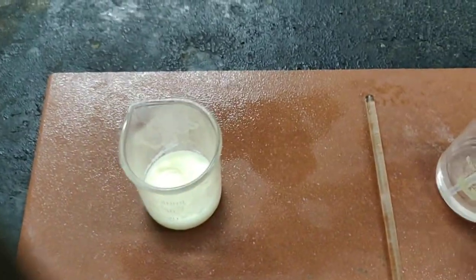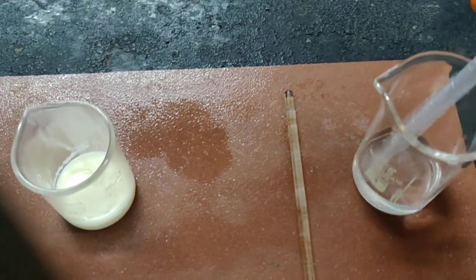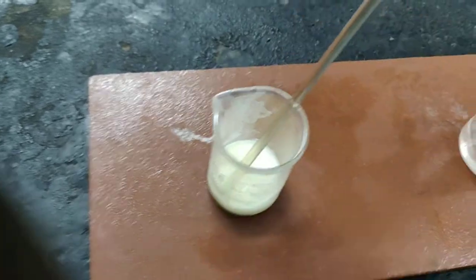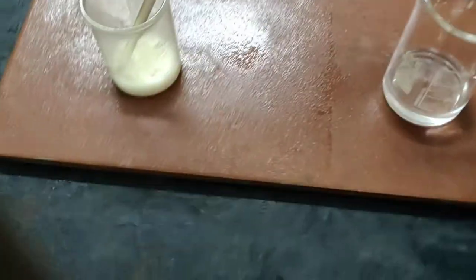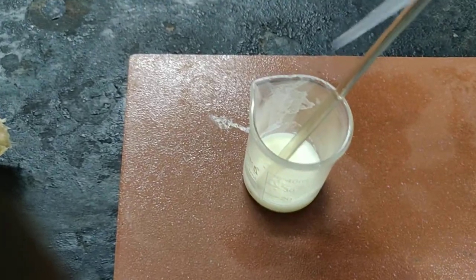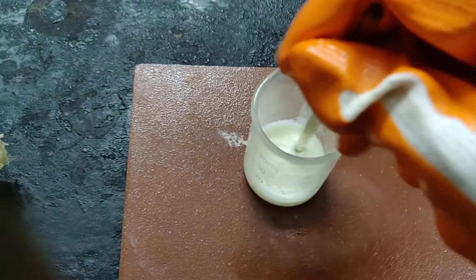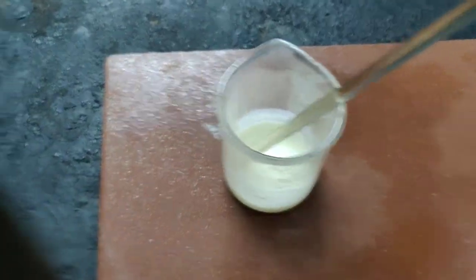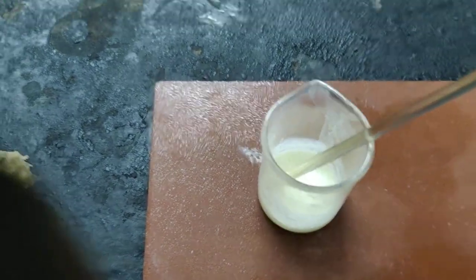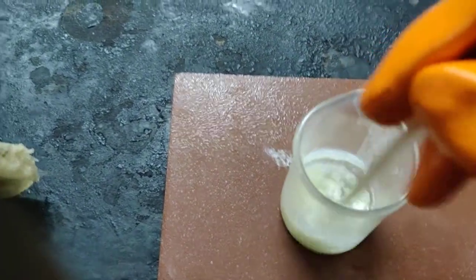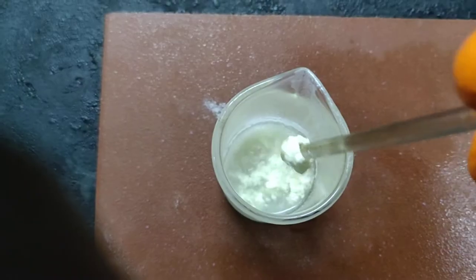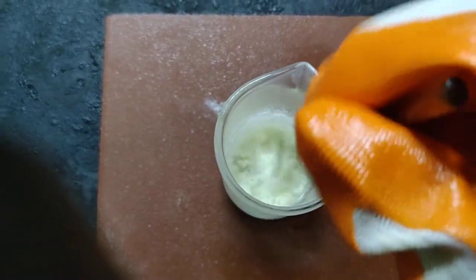The milk is sufficiently hot now. Go on adding 10% acetic acid with stirring. So add one drop, stir. Add another drop and stir well. See here the milk has already curdled. It has curdled.